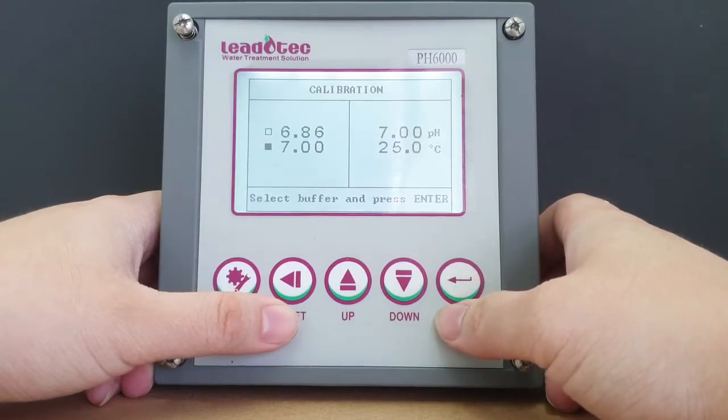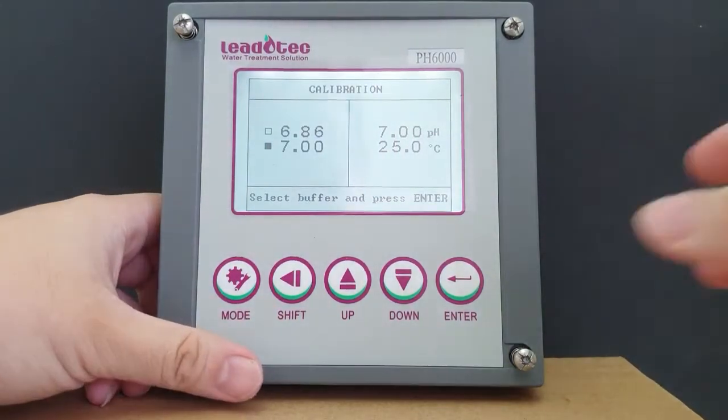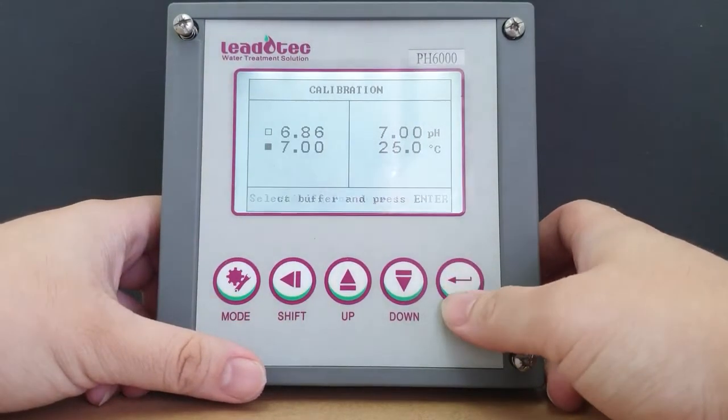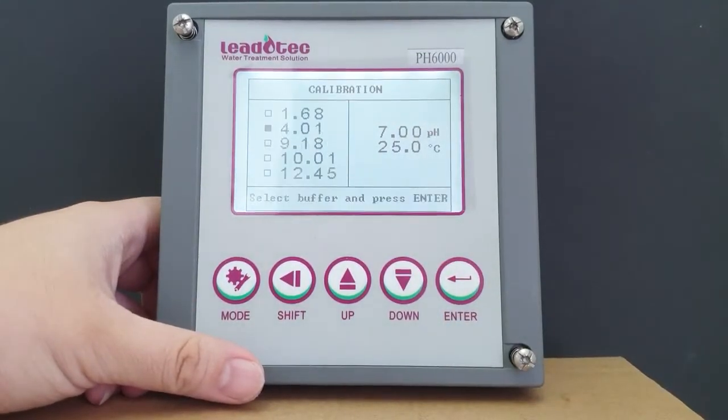So right here we have a 7.00 pH buffer and I'm going to press enter to select. Now we wait for an auto lock or you could press the enter button once the reading is stable.